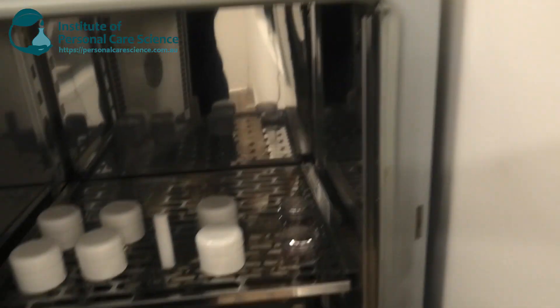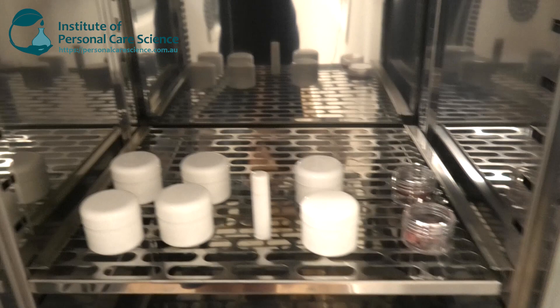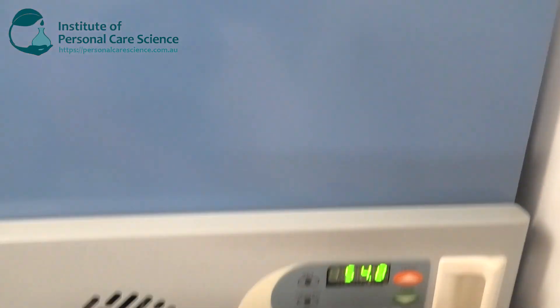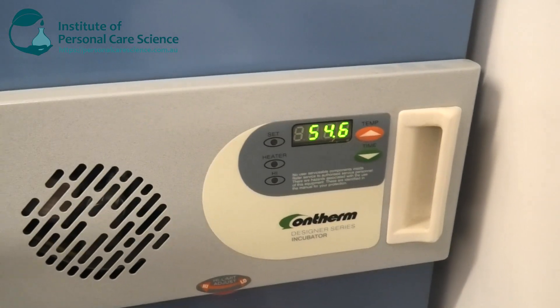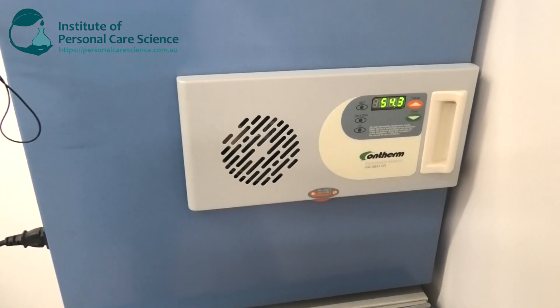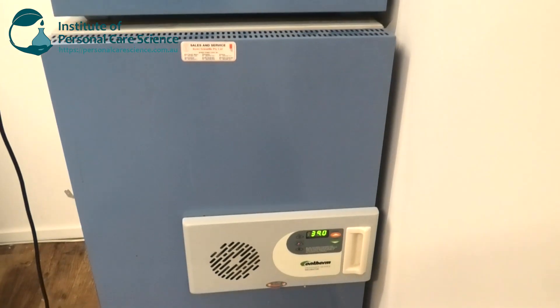If you were to get incubators half this size, you would still have plenty of room as a small brand. Looking in the smaller incubator, you can see there's plenty of room — we can fit more samples on the bottom shelf as well. You could get an incubator half this size, about the size of a standard microwave, and it's going to be plenty of room for a small brand.